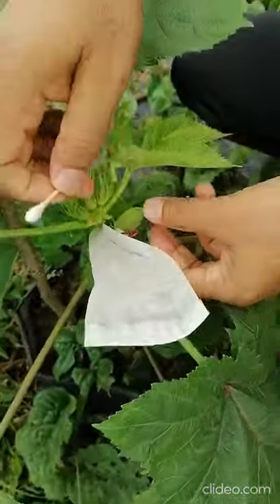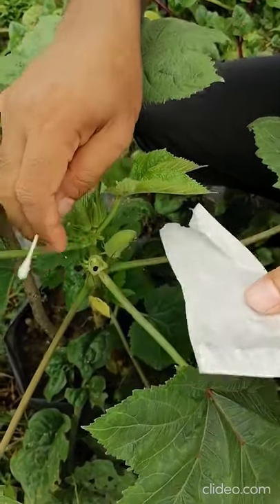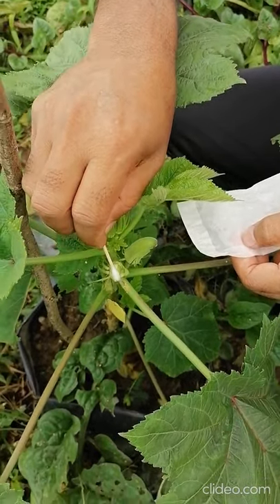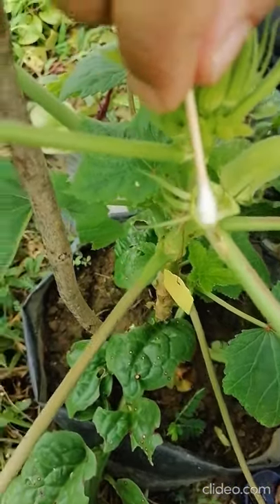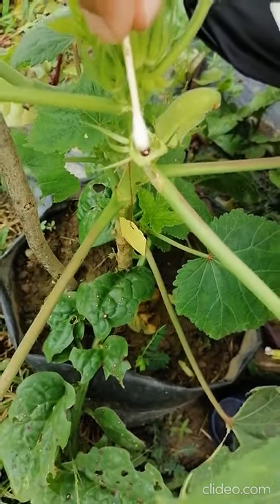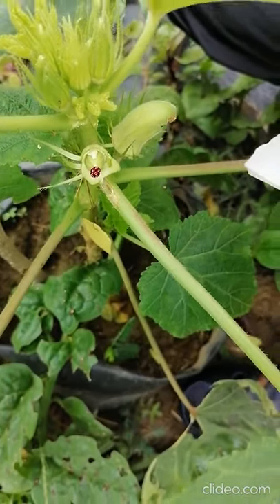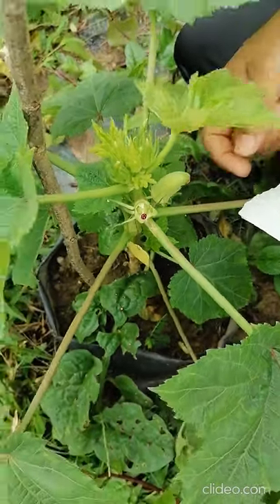This is the emasculated flower — just open carefully. Now you have to do the pollination here like this. This is the emasculation and hybridization — using the pollen you can see. Carefully do this — this is the hybridization. After that you have to bag again.